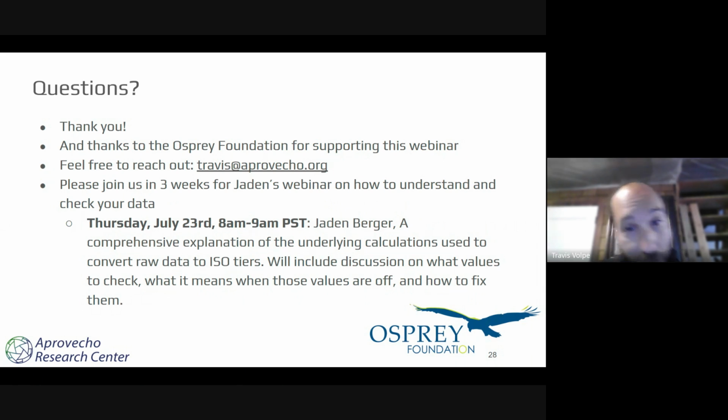Jaden will have another webinar going into much greater detail on how to understand and how to check your data. So we'll be talking about the calculations used, on how we convert the data into these ISO tiers, and a deeper discussion on the values that need to be checked on a regular basis, any common pitfalls and common issues that we might run into when we do process data.